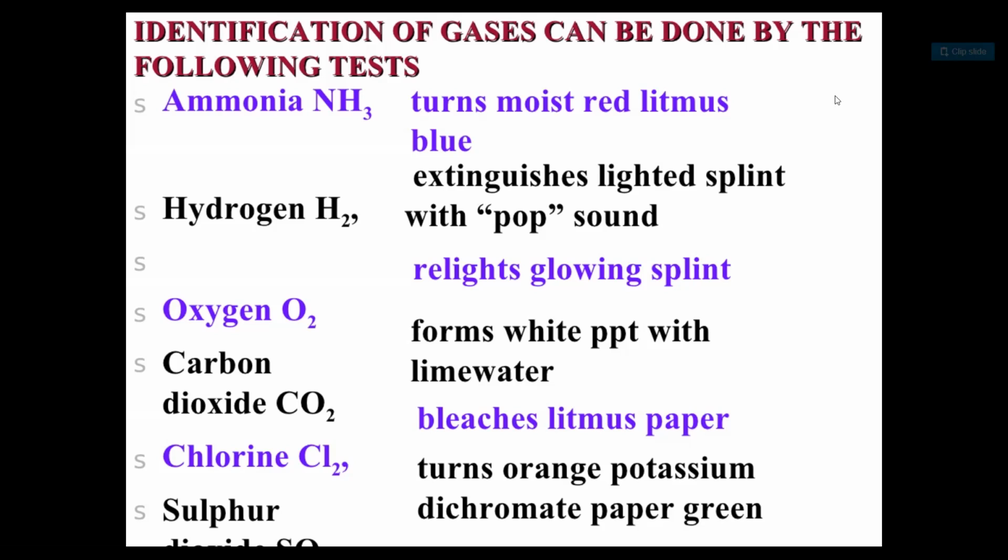So hydrogen gas will extinguish the lighted splint with a pop sound. In any experiment, if you insert the lighted match in the test tube of hydrogen, it will create a pop sound, exactly a pop sound. So the third test is oxygen.